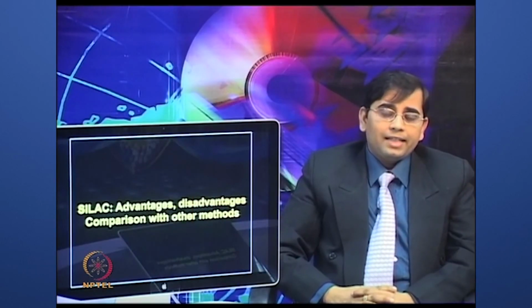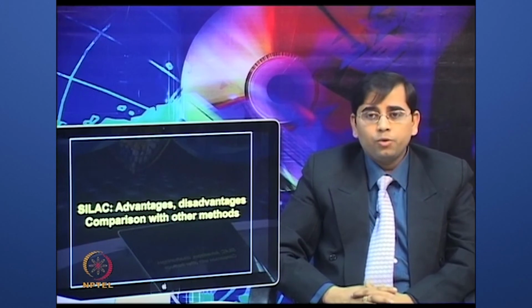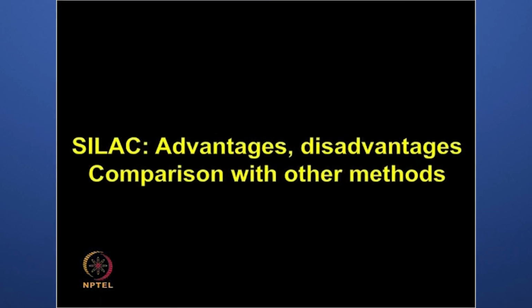So, after discussing the SILAC technique and watching this animation of this entire process, now let us discuss the advantages and disadvantages of the SILAC method and compare it with some other tagging methods.